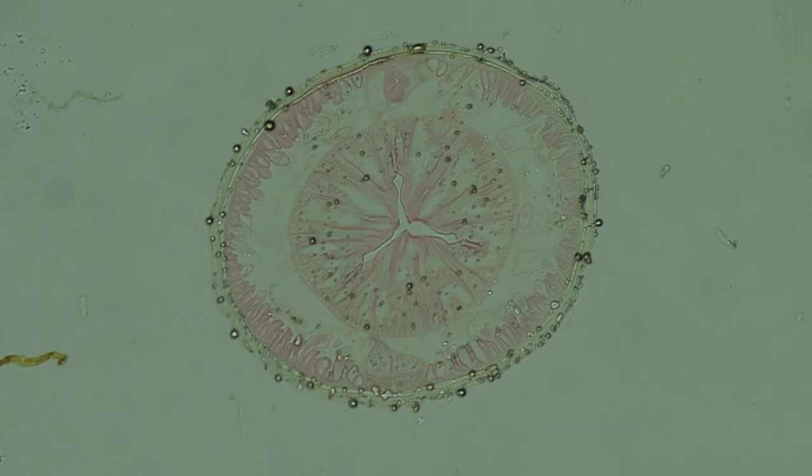Here's a cross-section through an Ascaris made at the level of the pharynx. Ignore the little air bubbles that are developing in this section, which is really old. But in this section you can see great cuticle, longitudinal muscles in cross-section, the dorsal and ventral cords, the pseudocoele, and of course the huge muscular pharynx.